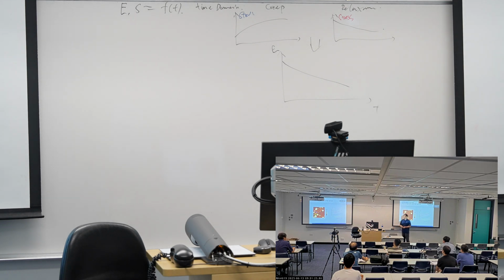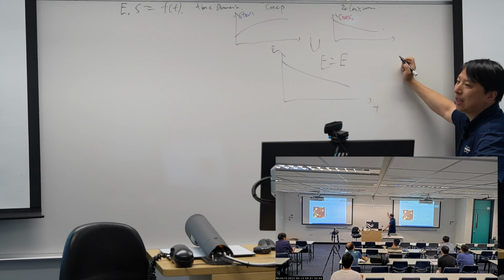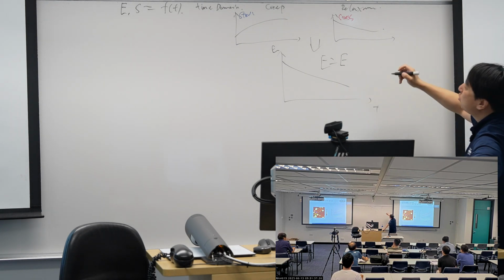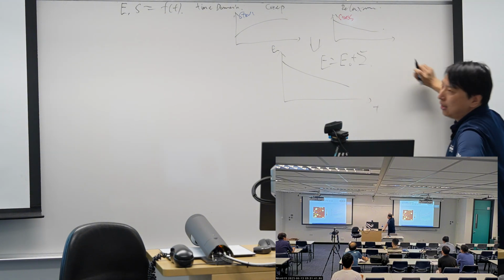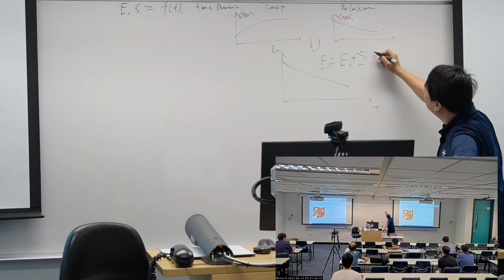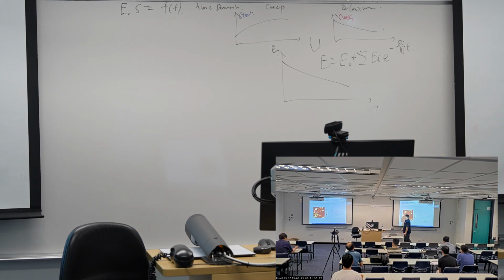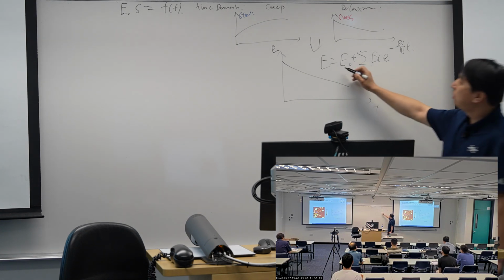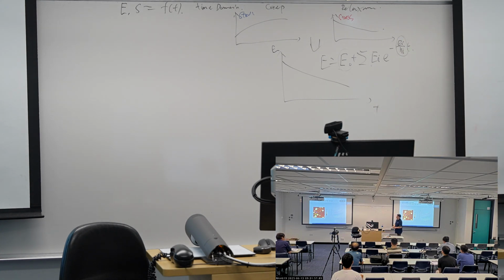And people widely use the Maxwell's model to fit this modulus change against time, to deduce the so-called Maxwell model. Usually they write it down in such an exponential function. And their key idea is to figure out this modulus and the viscosity.